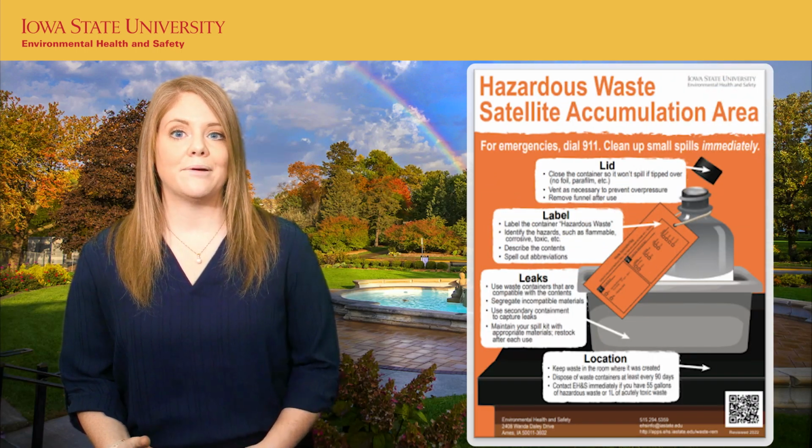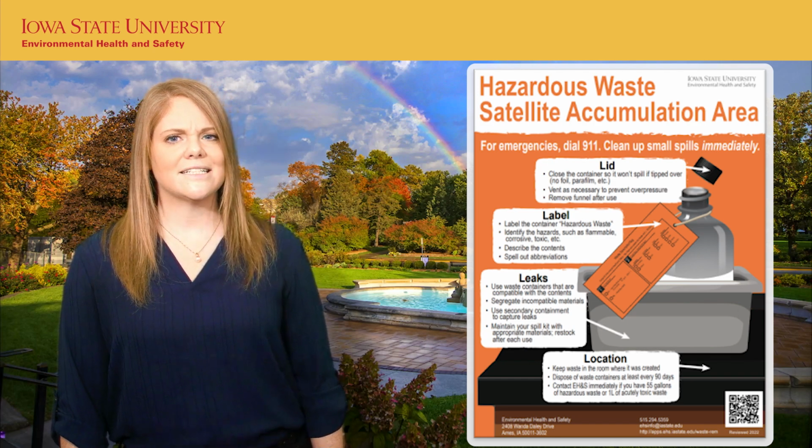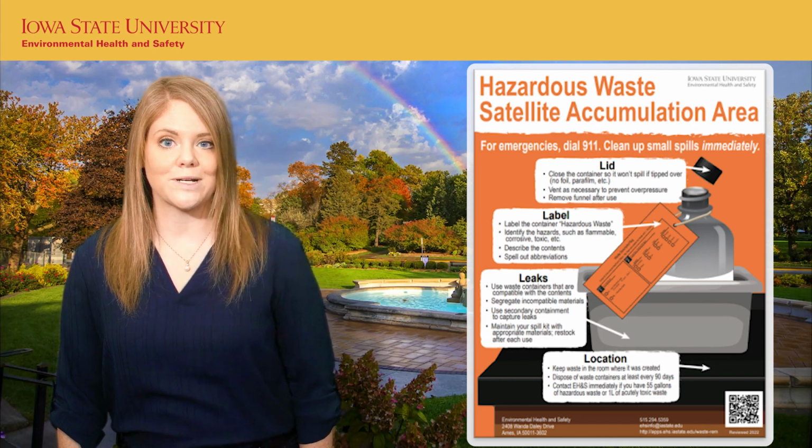Make sure your lab has a satellite accumulation area designated with an SAA sign. Contact EH&S for SAA signs and orange waste tags.